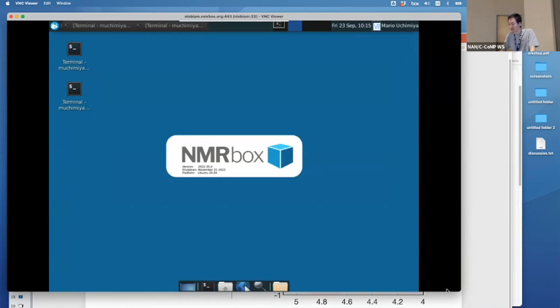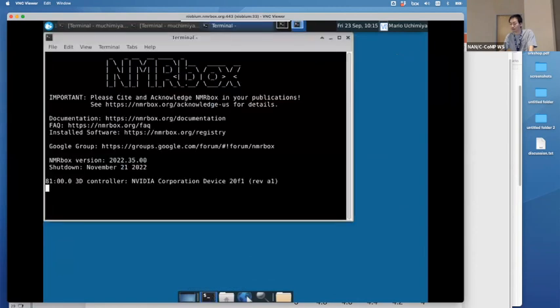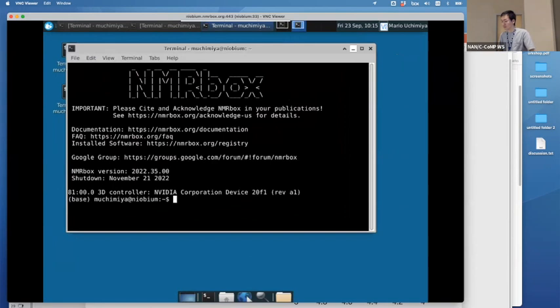So you get this thing on the bottom. You see that little tool thing on the bottom? It's right there with the $ sign. So he's going to click that. Now, you can do a lot in Linux by point and click in a graphical interface, but you notice that Mark displayed, he navigated around his virtual machine through the terminal.